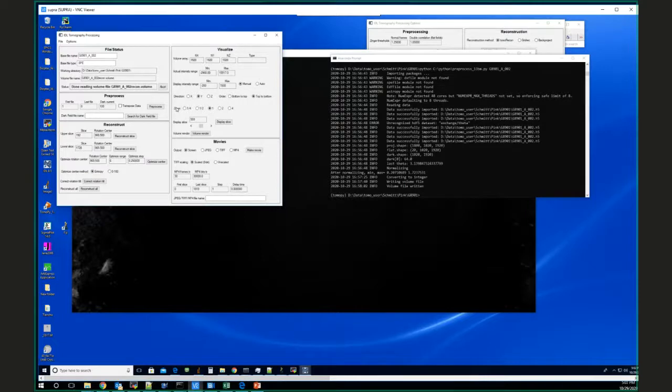Okay. So you basically don't need a focusing mirror, right? You just direct the beam with the slit and it will be good. That's right. The mirror is serving two purposes in this experiment. It is rejecting high energy X-rays. I'd have to look at those graphs I showed, but maybe above about 60 keV, we're getting rid of those photons. And that's good because those photons will go right through the sample. They'll hit the scintillator, they'll make light, but they give no contrast. They can actually degrade the resolution because they go right through the scintillator too.